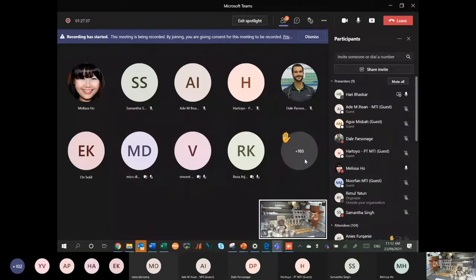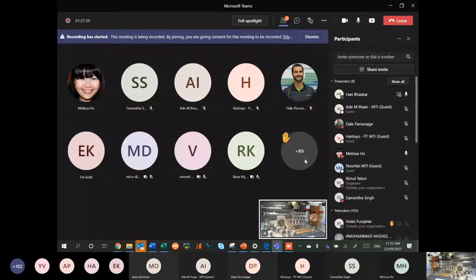If you have 32 millimeter samples, then these trays can be used and they can be mixed and matched. There's another tray with fuse beads, which again can be mixed and matched. And a fourth tray, at the far end, where direct cups are loaded. These are cup trays where samples can be put into cups. But the interesting thing is that you don't have to have cup trays throughout, you can have direct samples.